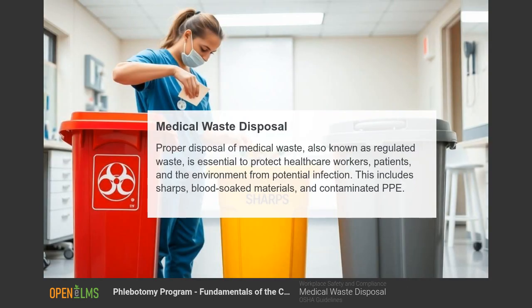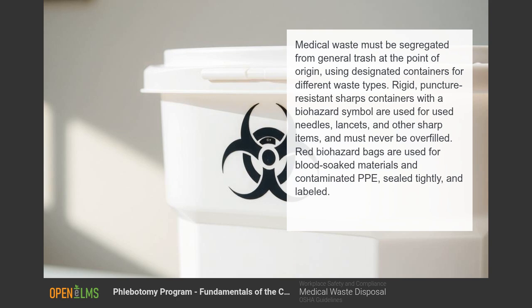Medical waste disposal. Proper disposal of medical waste, also known as regulated waste, is essential to protect healthcare workers, patients, and the environment from potential infection. This medical waste must be segregated from general trash at the point of origin, using designated containers for different waste types.